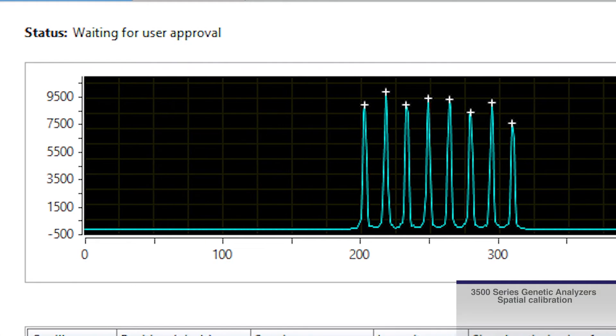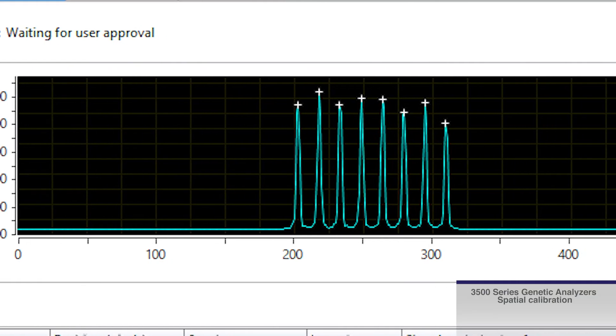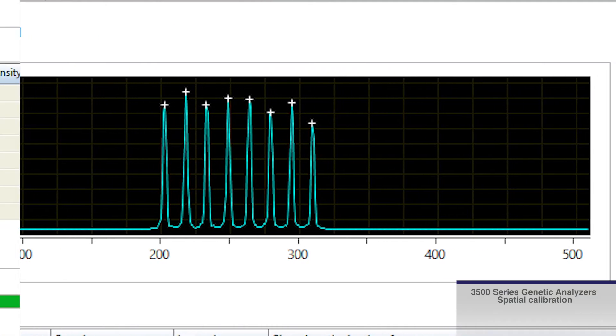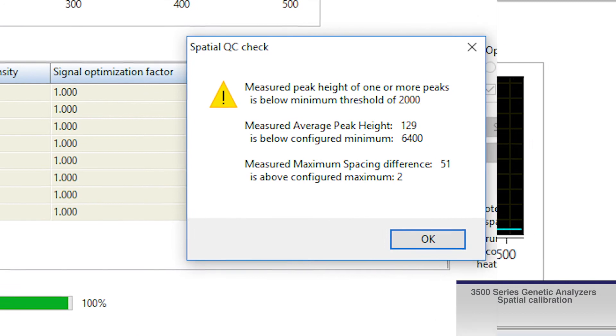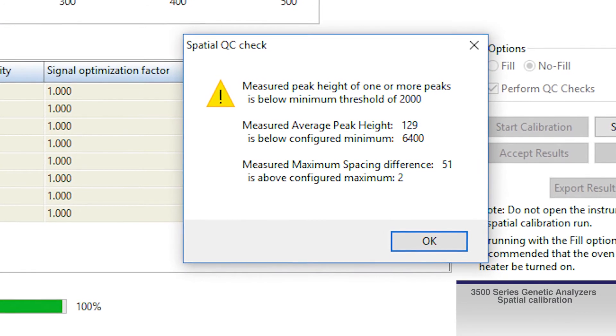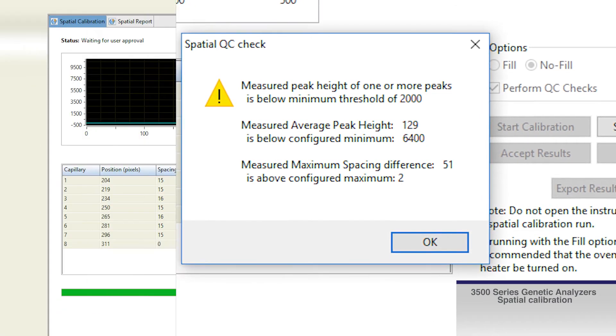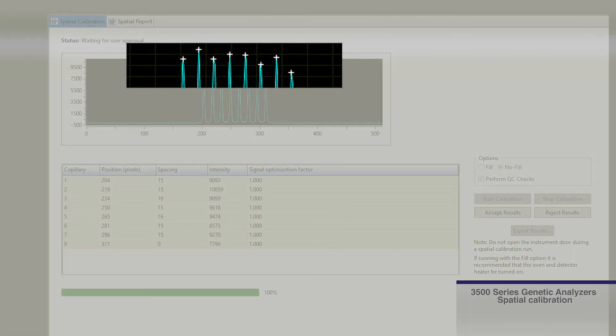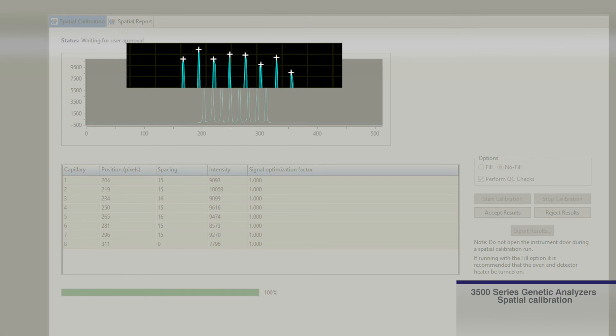Visually review the spatial calibration profile. For a passing spatial calibration, in addition to the QC check criteria, the profile should show one sharp peak for each capillary. Small shoulders are acceptable.